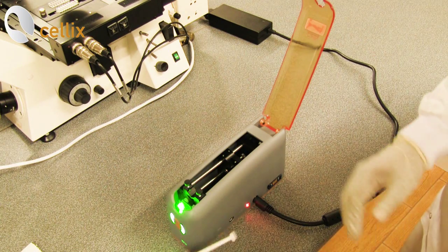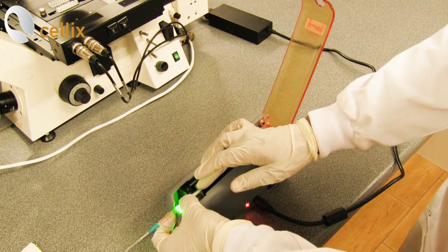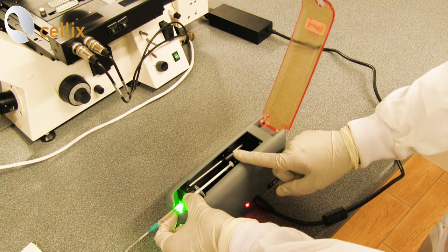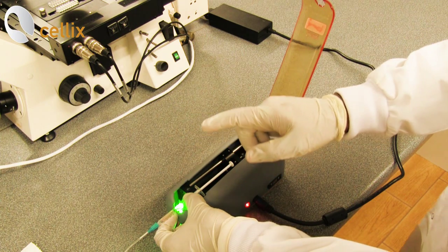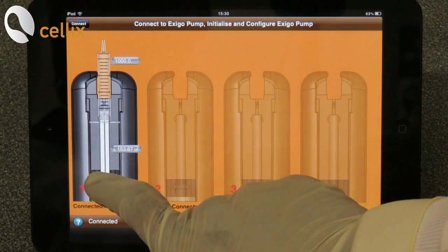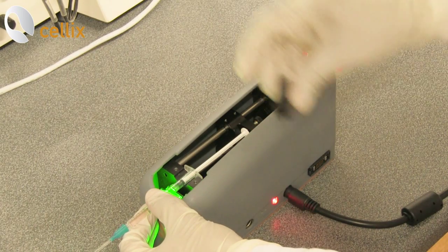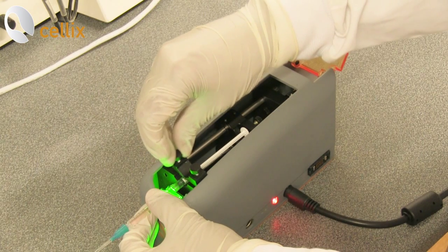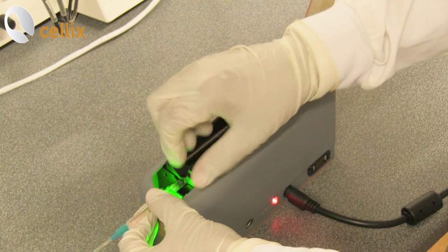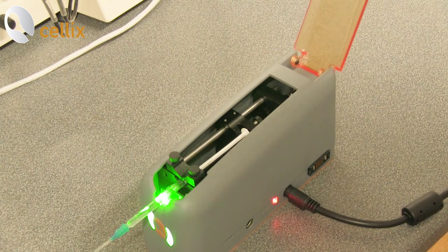Next we have to connect the syringe into the syringe slot. For that you remove the holder, put the syringe in, and you'll see the plunger is a little far, so we have to adjust the plunger using the application on the iPad Mini. To position the plunger, just push the syringe. Now the plunger is in position and we are going to clamp it with the holder. Now the syringe is set.